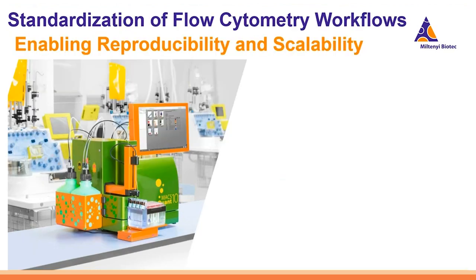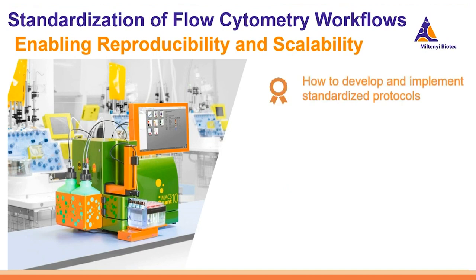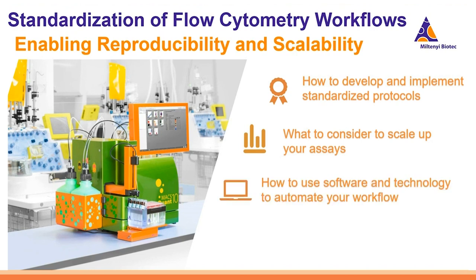A few of the main topics that we are going to cover in this webinar include how to develop and implement standardized protocols, what to consider to scale up your assays, how to use software and technology to automate your workflow, and we will have a brief summary and some time for questions at the end.